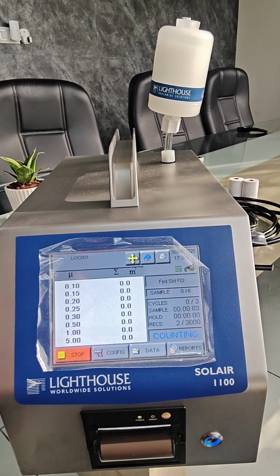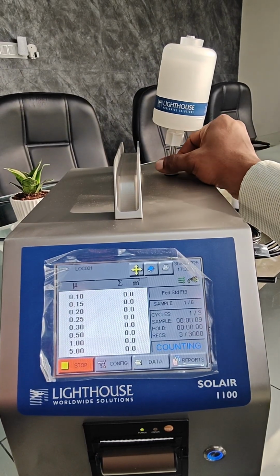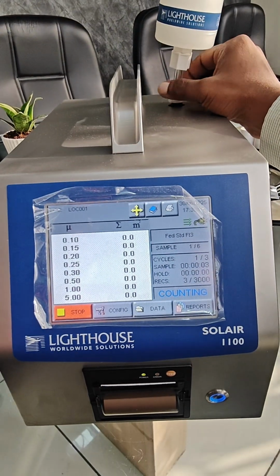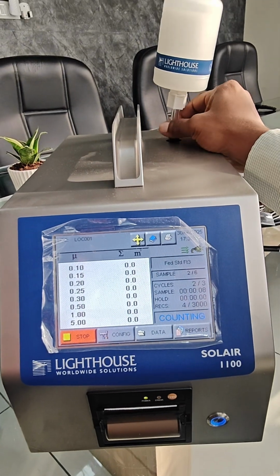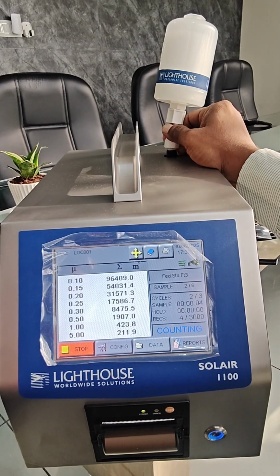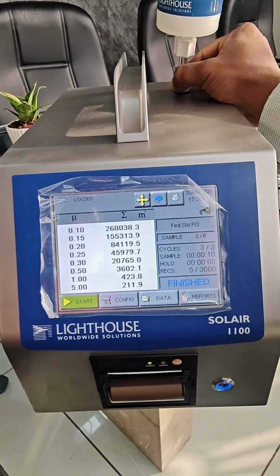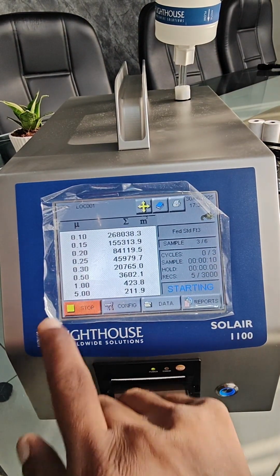You can increase the counts also. It is a 0 count filter, a purge filter will also come along with the instrument. So this is right now showing 0 count, but I'll make a change in some data. Okay, now you can see some of the counts. Okay, we'll start once again.